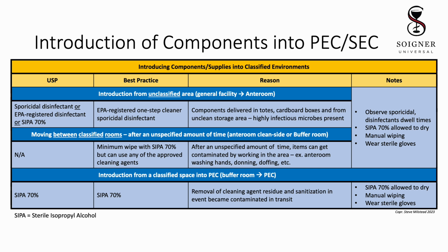However, if the product is introduced into the anteroom and sits for some unspecified amount of time, it should be wiped down again with something, at a minimum sterile IPA, prior to being taken into the buffer room, but then wiped down again with IPA prior to being introduced into the PEC.